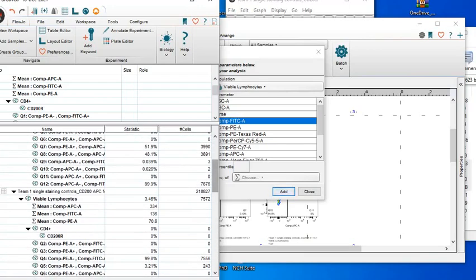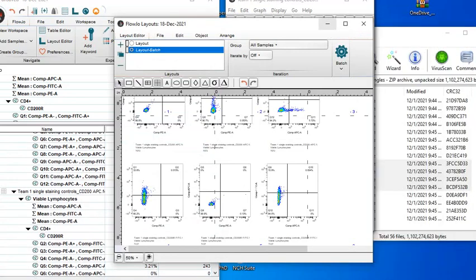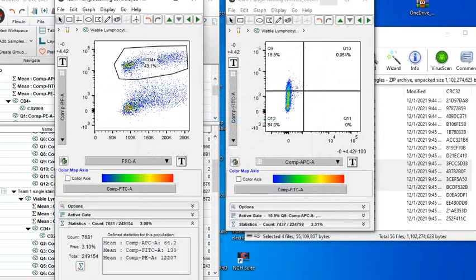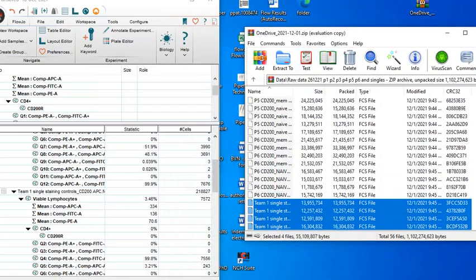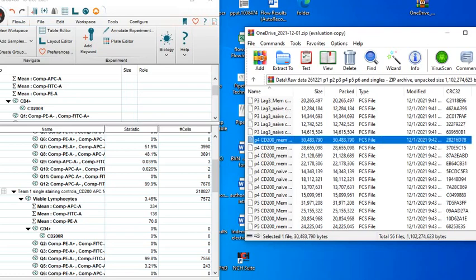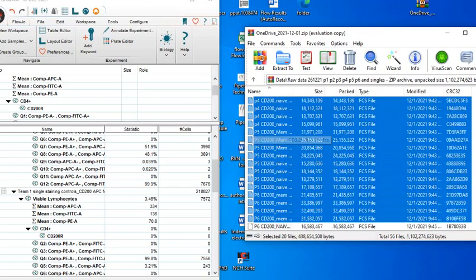Okay, that's for that. So now we are going to add our samples to the protocol. We'll come back to show you how to do the contour, but let's just analyze one of our samples and we'll look at the percentage of CD200 and its receptors, and also your CD4 in the biopsy mouse.